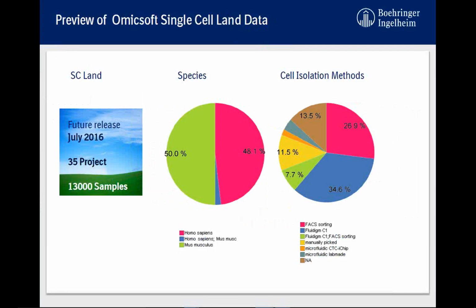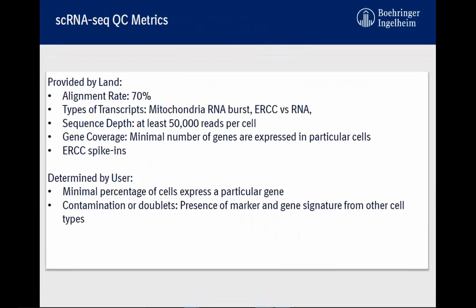We also look at types of transcripts, because one challenge of single-cell RNA-seq is that for all the populations we need to identify them. So we need to know what they are. It's just like each cell has its own driver's license or social security number. We just want to know who they are, using our informatics methods.